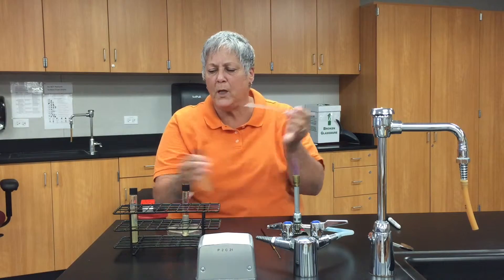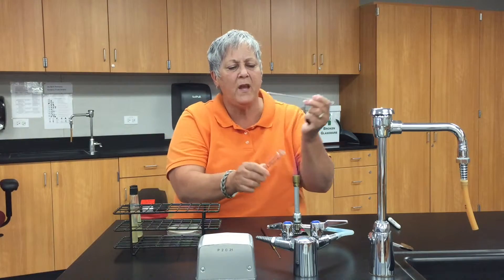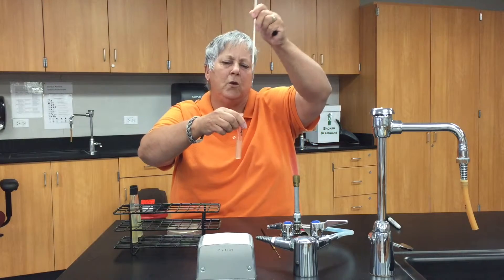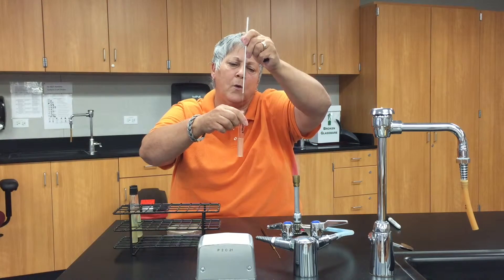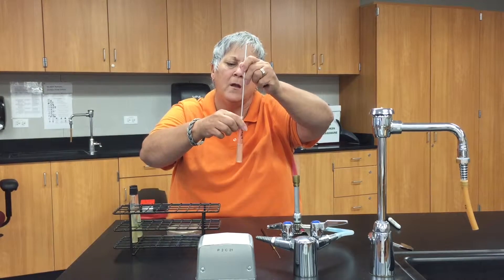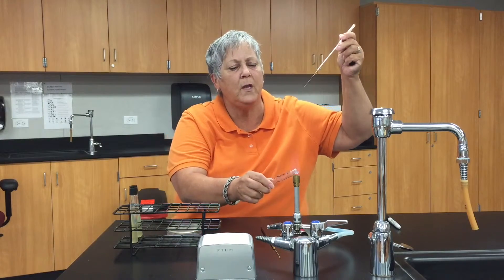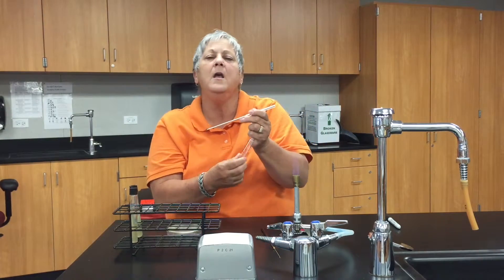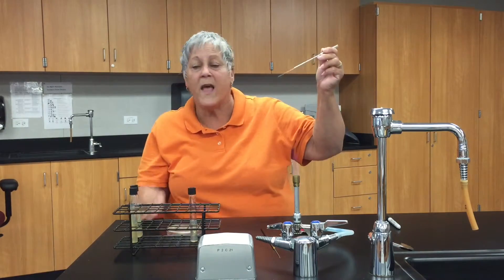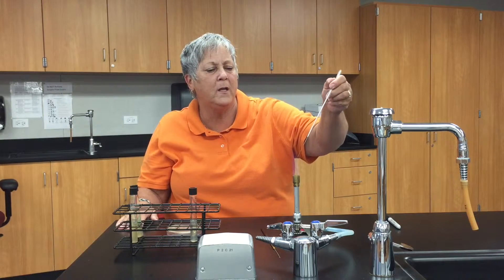Now I'm ready to pick up my motility media deep. Same deal — remove the cap, flame the lip of the tube. What I want to do is stab straight in to the motility media and remove the needle, trying not to tear the agar from side to side, because that makes it difficult to interpret your results later. That tube of motility media is inoculated. I'll flame my needle again.